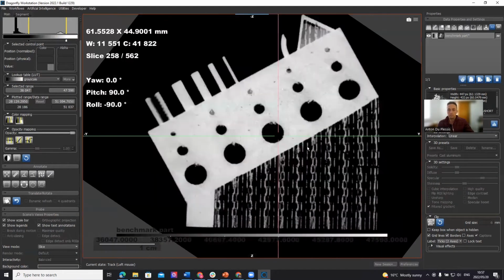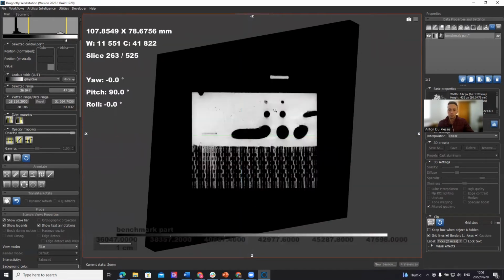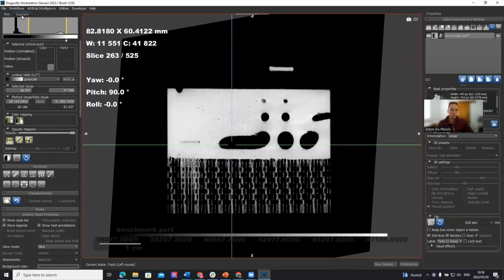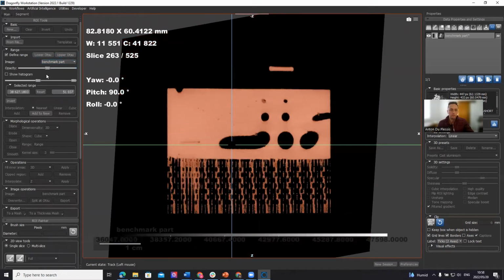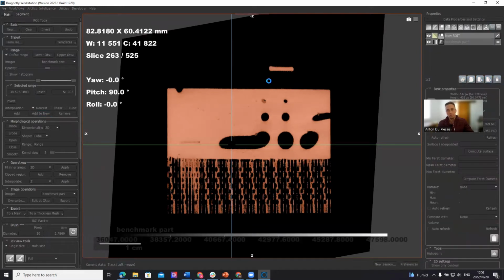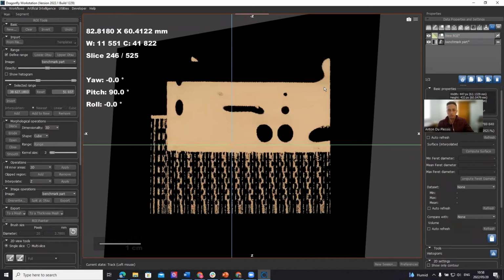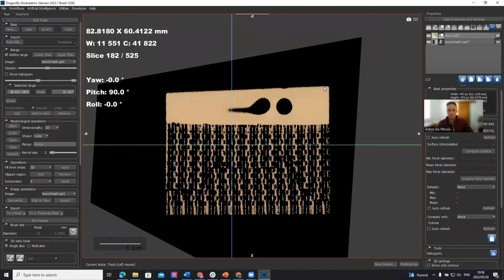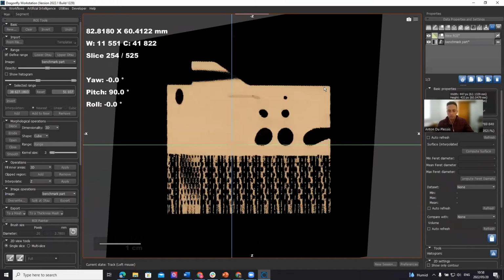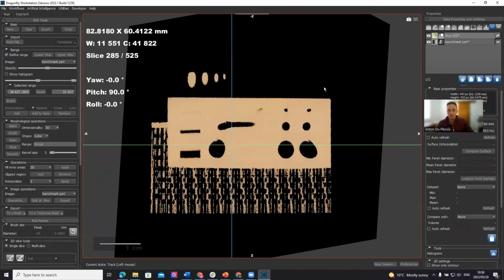In order to do that, we look at this object in one of the 2D views. Let's take this one, for example, and we want to make a segmentation. We're going to use the define range upper Otsu to define the material of interest that we want to apply a thickness mesh, or thickness mapping, to. If we look through the data, we might find some loose particles on the outside of the part which have been scanned together, or this might be noise particles, disconnected sections.